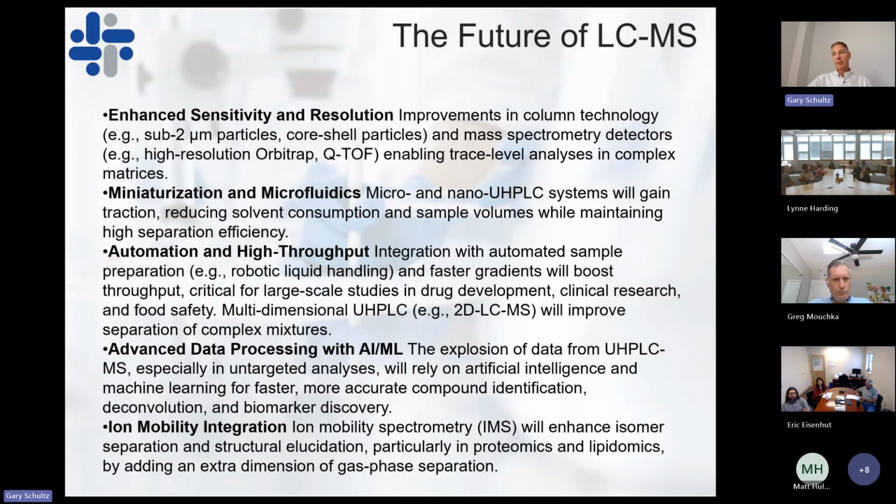So I hope that this presentation was able to give you a little bit of insights into what we're capable of achieving today with LC-MS. The future of ultra-high performance liquid chromatography coupled with mass spectrometry is really going to be enhanced and have significant contributions in the field of proteomics, metabolomics, and environmental analysis.